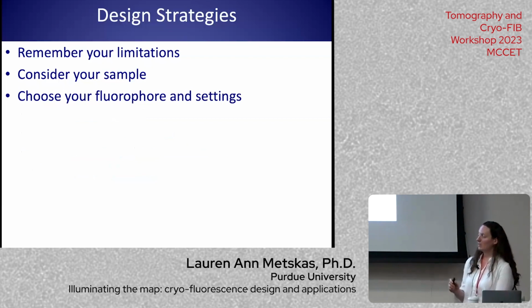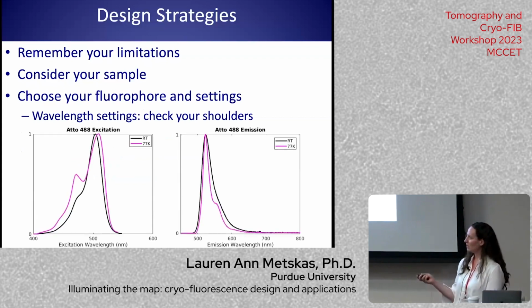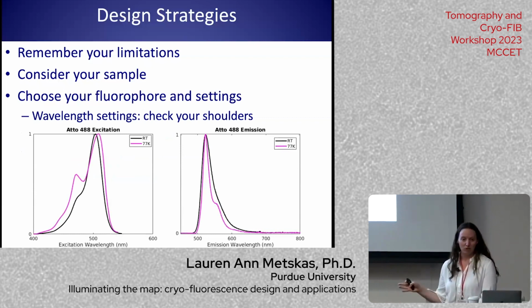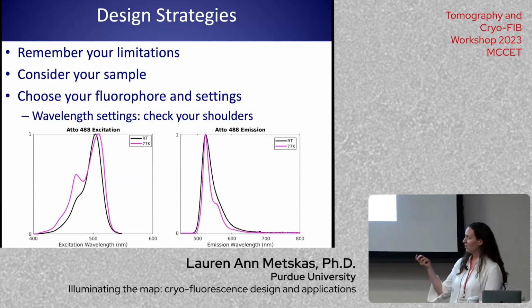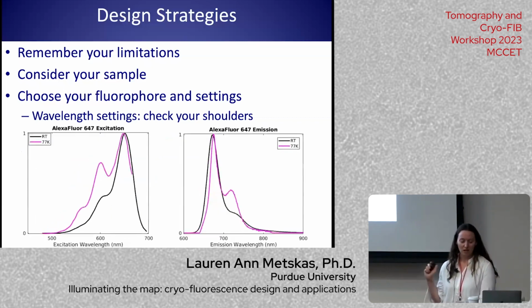All right, and then finally, how do you choose a fluorophore? Think about the wavelengths, check your shoulders. Again, in these spectra, this is showing you what light the fluorophore is going to emit at. This is showing you what light it's going to respond to for excitation. Some fluorophores don't respond that much to temperature, and so in this case, you could use the same settings for your filters and you'd be fine.